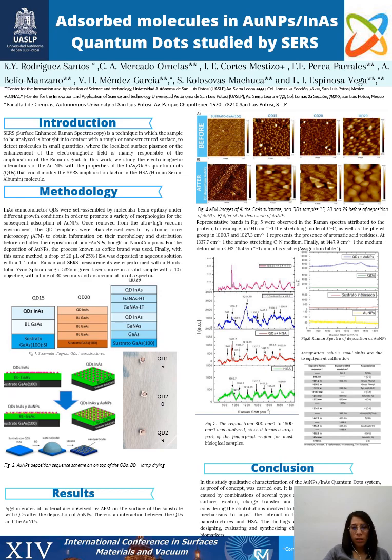Also, we deposited HSA in aqueous solution, from an analyte in Raman. We found representative bands observed in the Raman spectra attributed to the protein, for example at 946, the stretch mode of the C-C carbon.